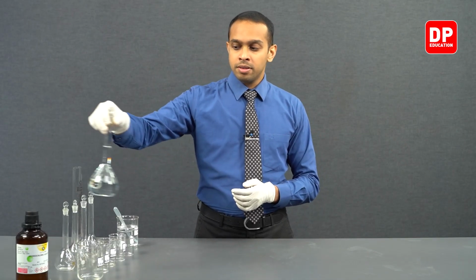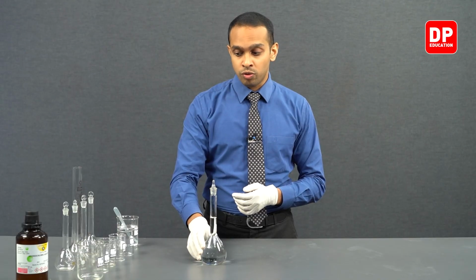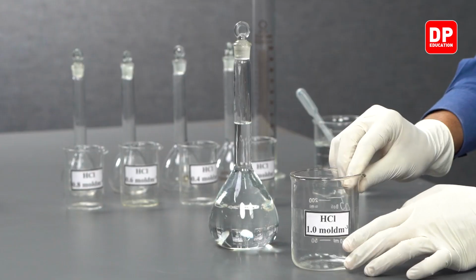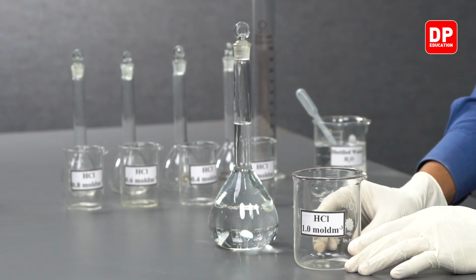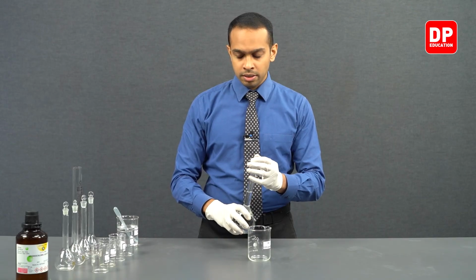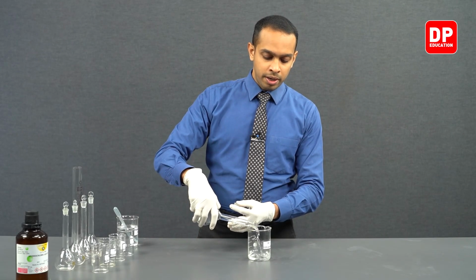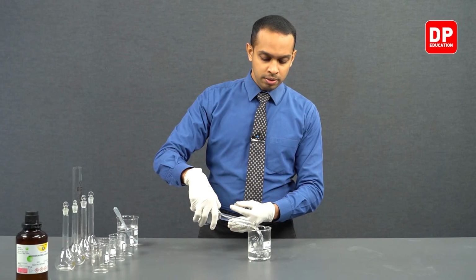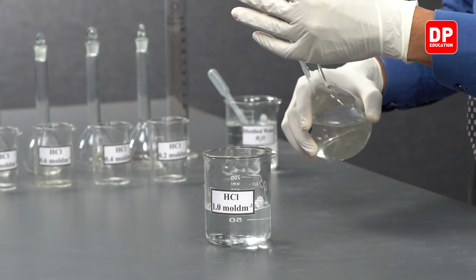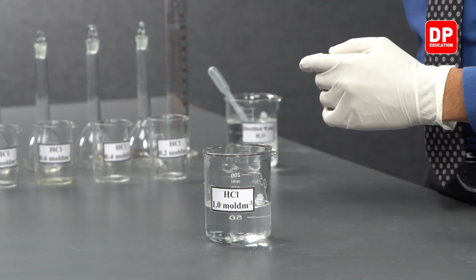We have the 1 mole per decimeter cubed HCl solution we prepared earlier, and we have a beaker labeled 1 mole per decimeter cubed HCl. So we are going to be adding the HCl solution we prepared into this beaker so that it will be easier for us to measure different volumes that we need for this part of our experiment.